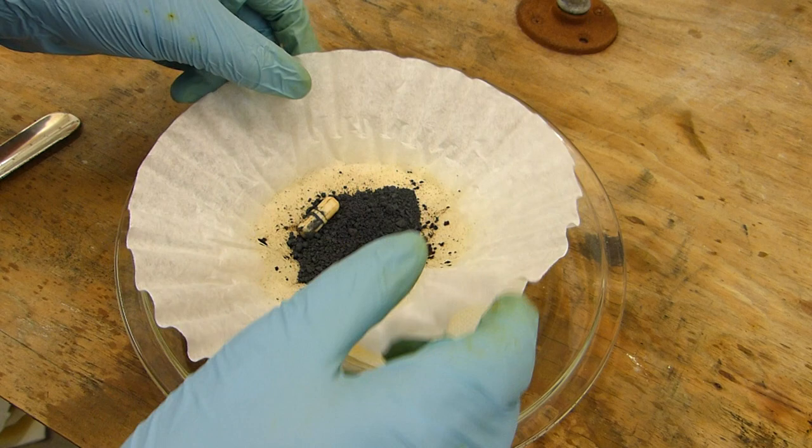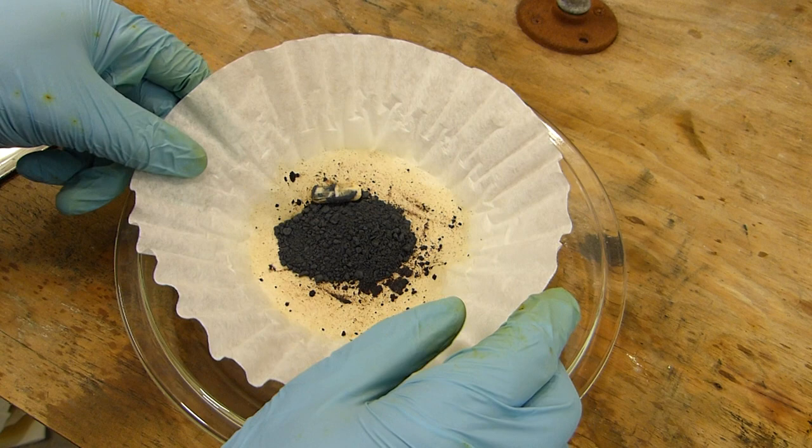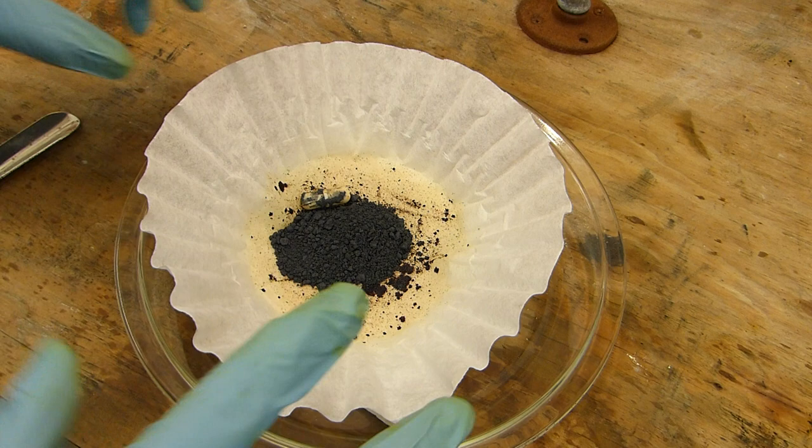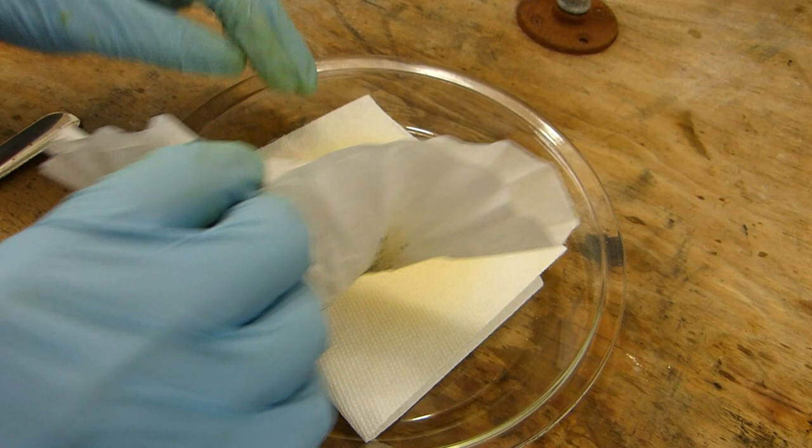After a bit of drying the iodine is now a mostly free-flowing dense sort of dark blue maybe purple solid. And I've changed this filter paper out once because it was getting really saturated and I want to try to dry the iodine out as quickly as possible. Of course because it evaporates at room temperature.